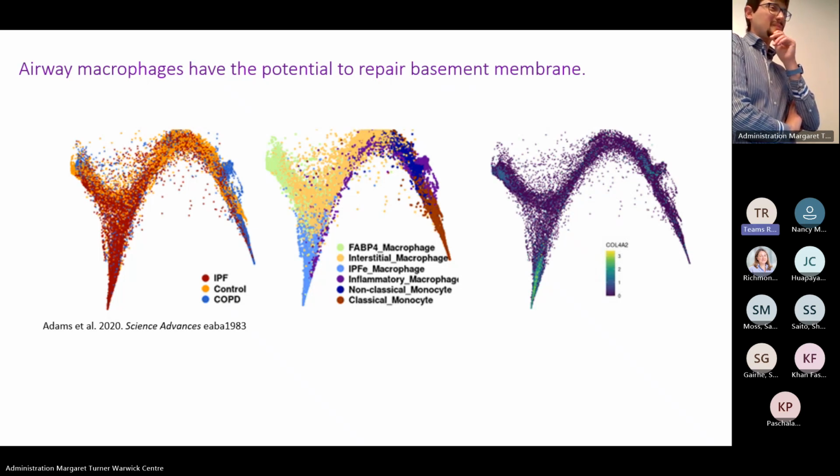I'd like to circle back a bit on using this approach to detect protein. Currently, with the technology you're using, what's the most difficult part to detect? The biggest limitation of PLF, I would say, is coverage. Unlike traditional proteomics, where you can have one or two peptides from your protein and correlate that with abundance of your protein, whether it goes up or down, here you really need quite a few peptides across the entire structure of a protein in order to identify a difference. So it's really the top 20, 30 proteins that you get really good coverage for.